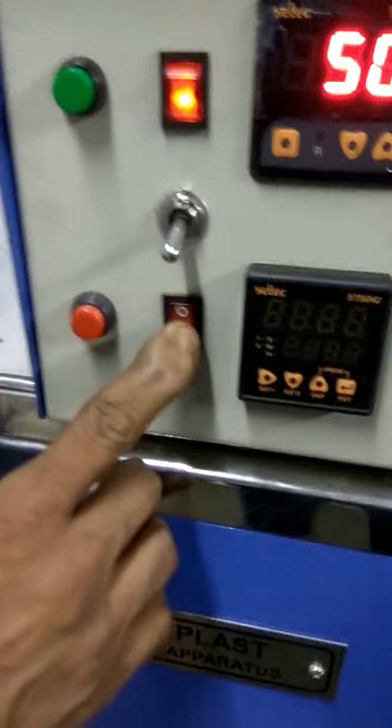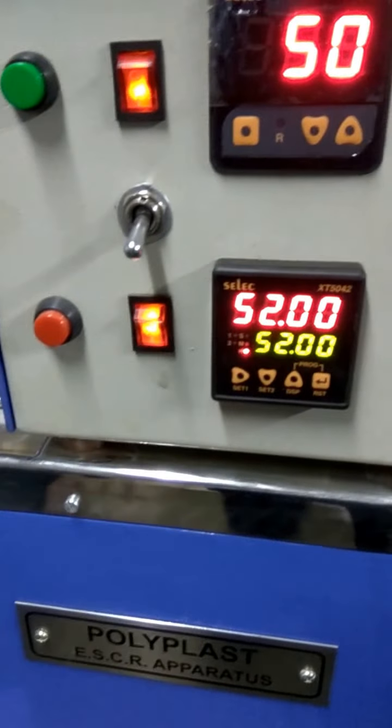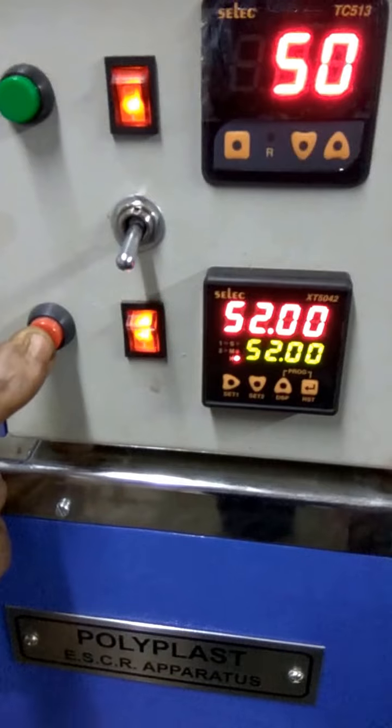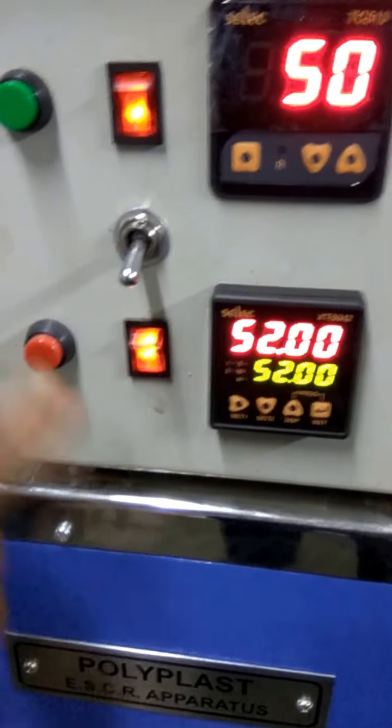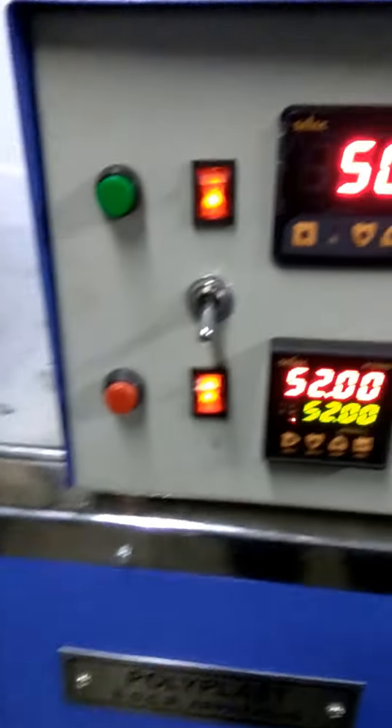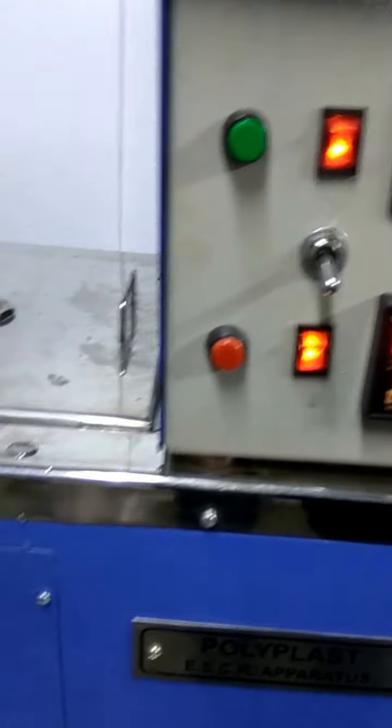There is a timer. You can press it and it will start. You can see the red light is blinking. The timer is kept for 50 hours and it reduces slowly. There is also a light switch provided.